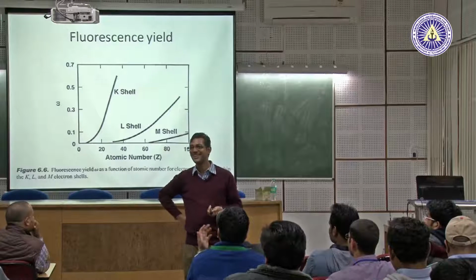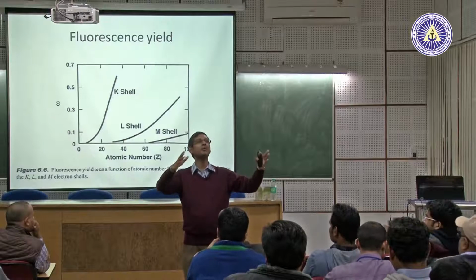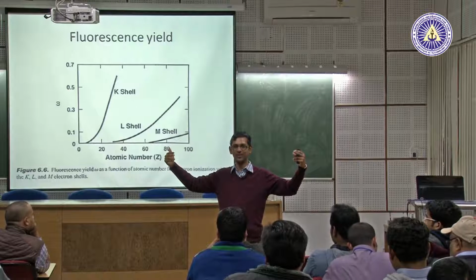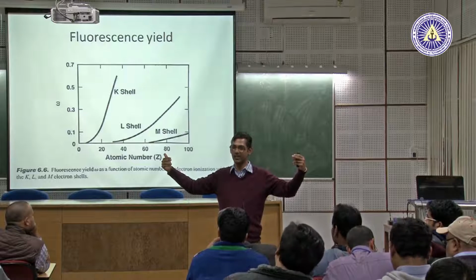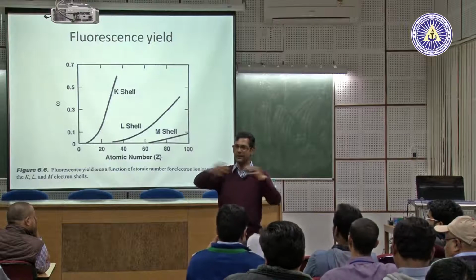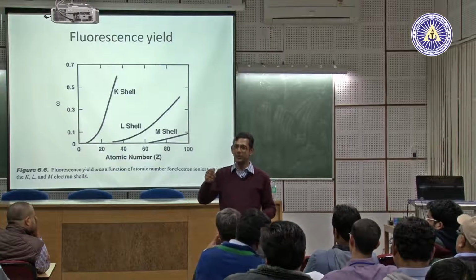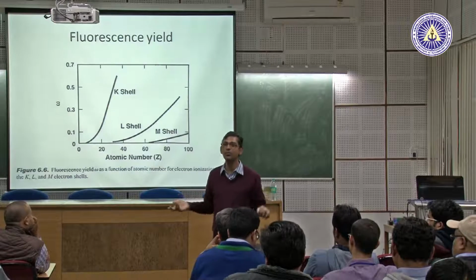No idea? UV light falls on the material and it emits light. Think about a tube light. You have gas inside it and two electrodes, right? If you apply voltage, the gas gets ionized. All these ions then fall onto a coated material on the surface of the tube light. If you break the tube light, you will find the white coating layer, right? When the ions fall on that, it generates light. That is called fluorescence.